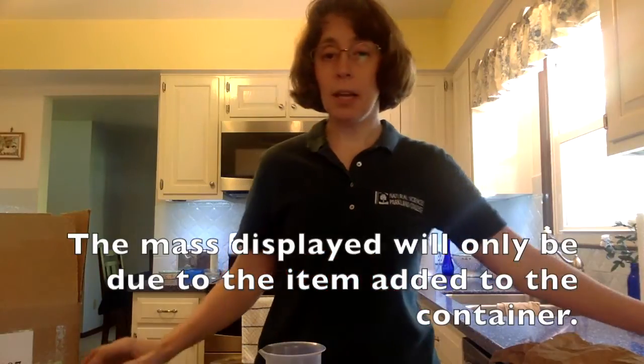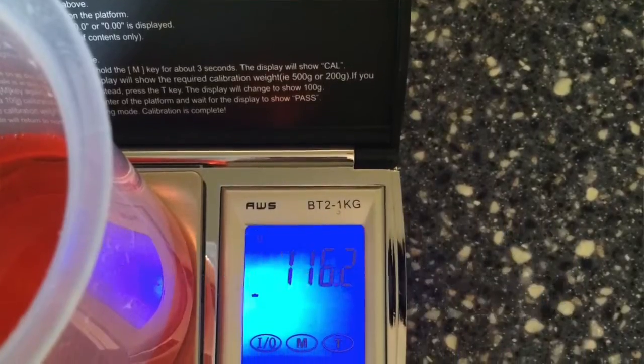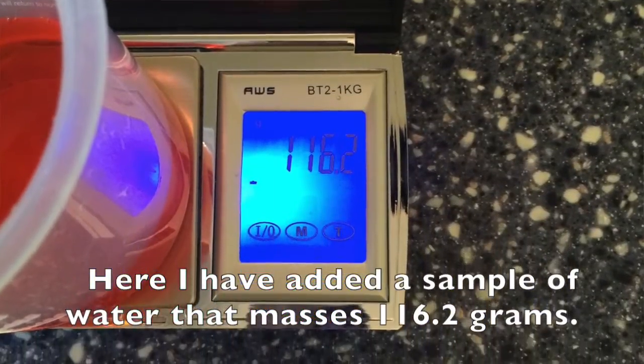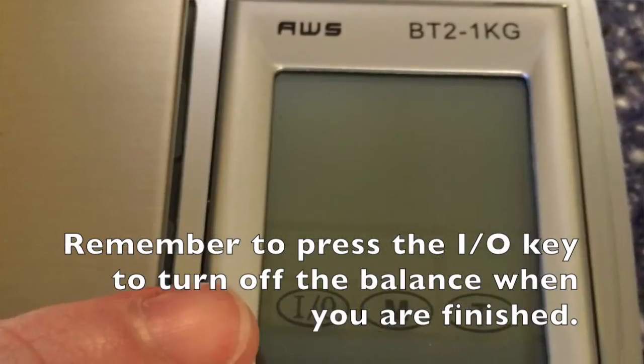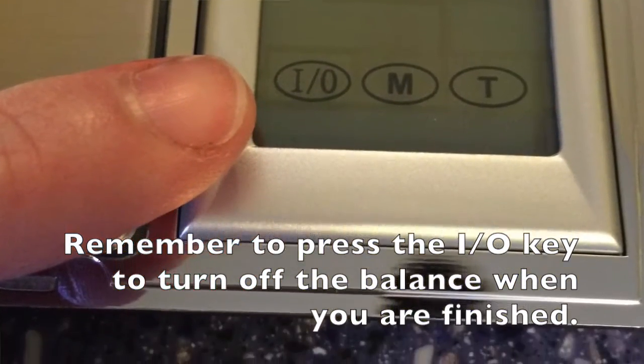The mass displayed will only be due to the item added to the container. Here I have added the sample of water that masses 116.2 grams. Remember to press the I/O key to turn off the balance when you are finished.